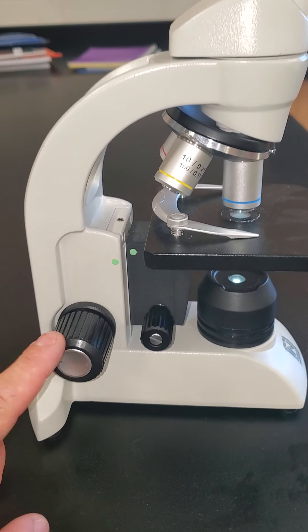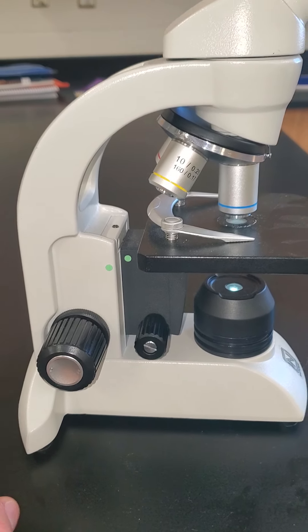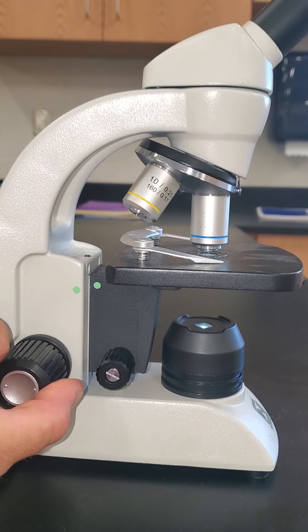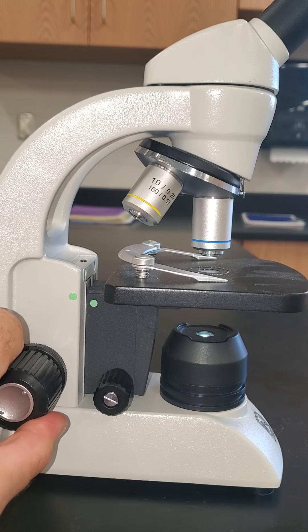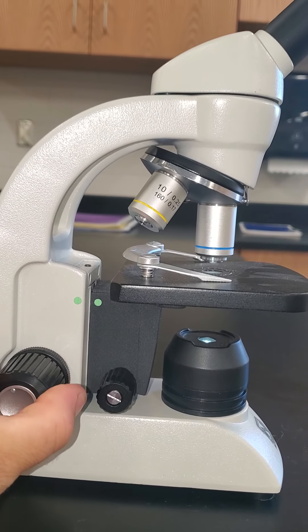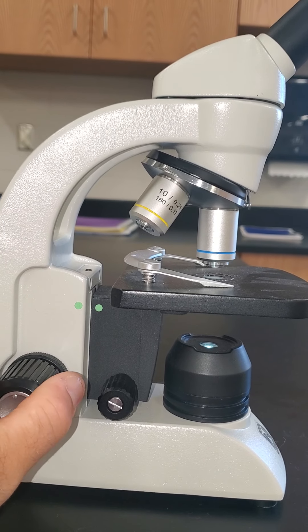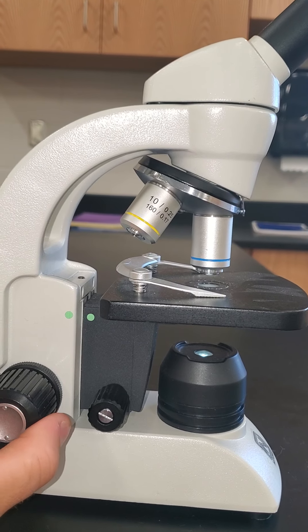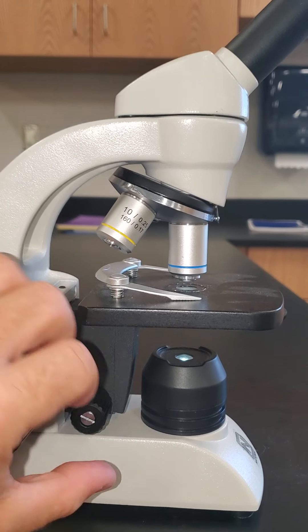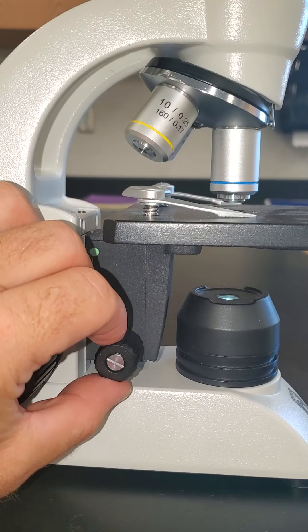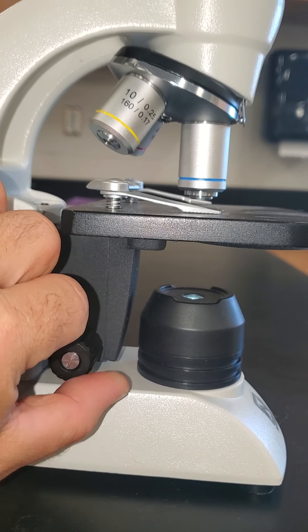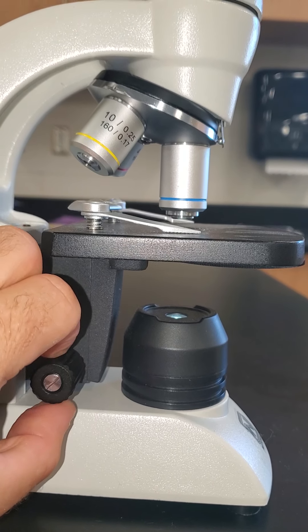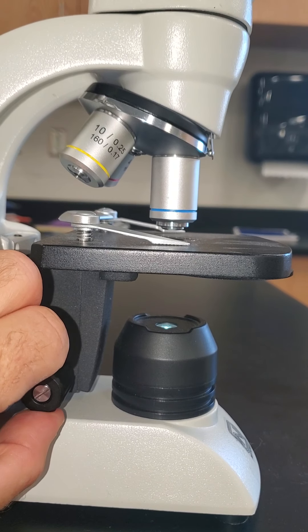Down here are going to be our adjuster wheels to allow us to focus our image. The bigger wheel moves our slide table more. You can see that I can actually see the slide table moving a lot with the coarse adjustment. So usually that is the wheel we start with to try to get our image slightly in focus. To really sharpen our focus we would use the fine adjustment wheel. As I turn that, you actually cannot with your eyes see the table move, but it is moving very slightly.